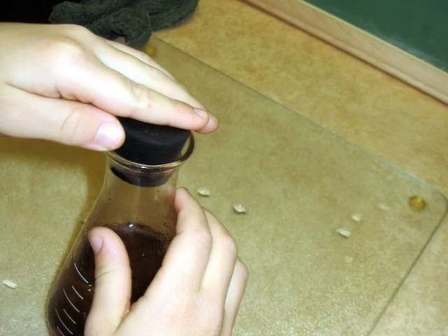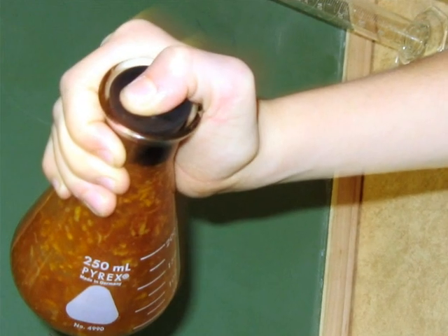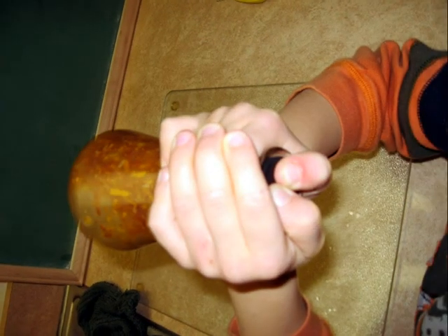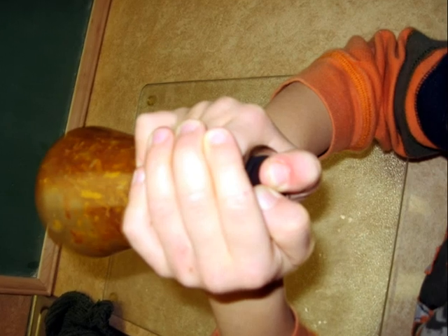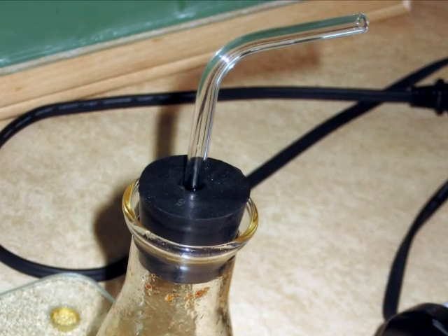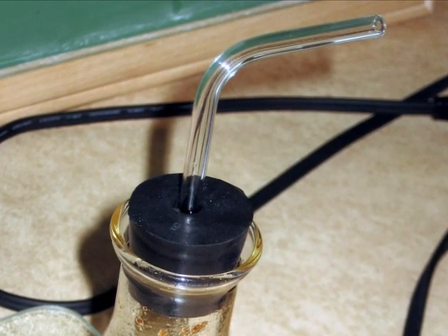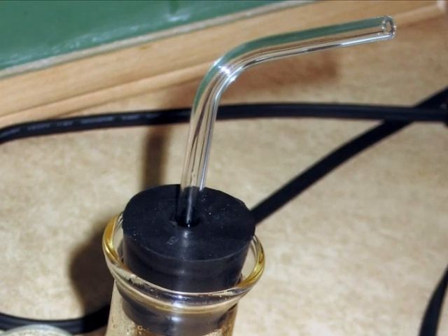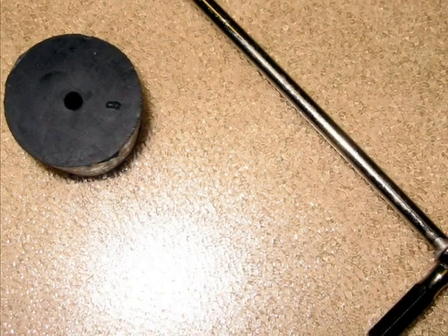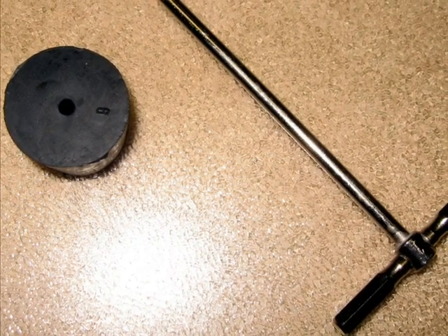Insert a solid stopper into the flask. Holding the stopper in tightly with one hand, or even better with 2 hands, shake the flask for 5 minutes. Next, you will remove the solid stopper from the flask and replace it with a stopper glass tube assembly as shown in the picture.